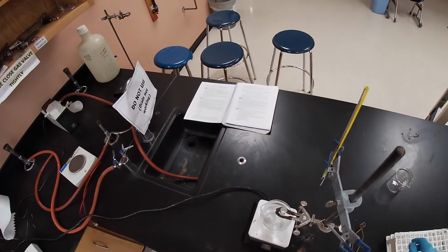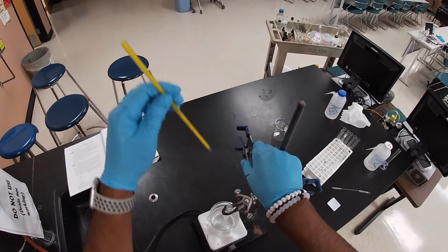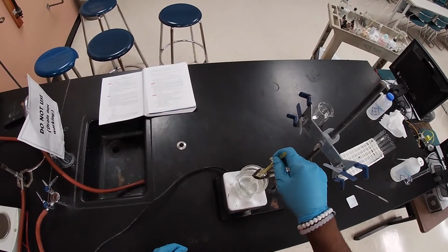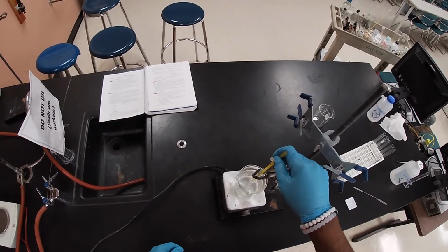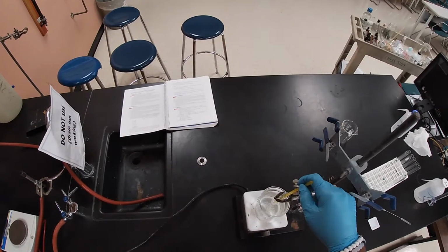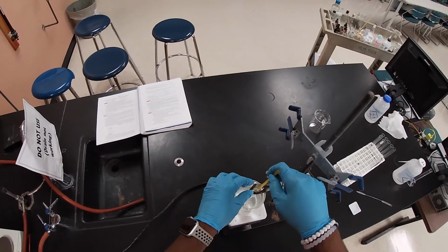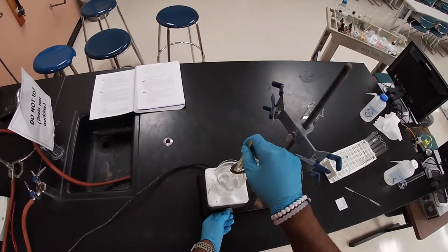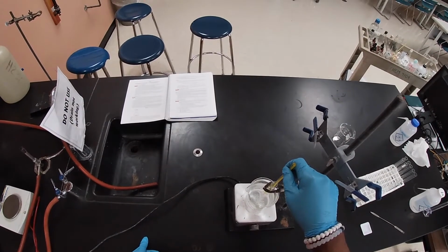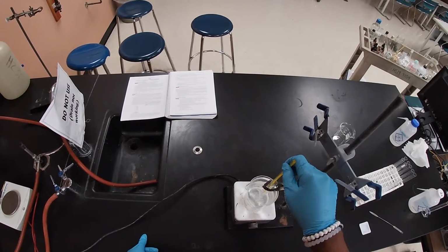It says here to do it with a thermometer, so I'm gonna do that. I gotta be careful, don't want to break it. So then what I gotta do is stir. And as soon as it dissolves, I gotta take the solution off the burner, off the heat, and see the temperature as it cools down.